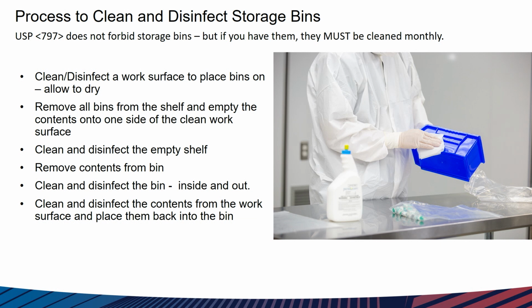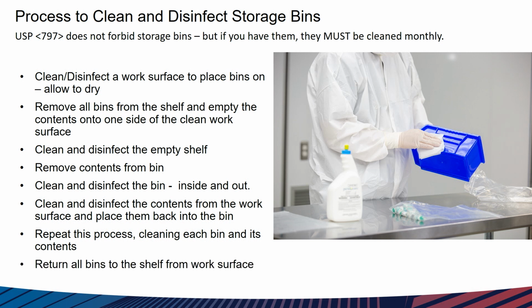Then we need to clean and disinfect the contents that were on the work surface, and place them back into the bin. That's where using a Ziploc bag can save you a lot of time. We need to repeat that process, making sure you've cleaned every bin and its contents, and then you can put all those bins back up onto the freshly cleaned, disinfected shelf. It is a cumbersome process.